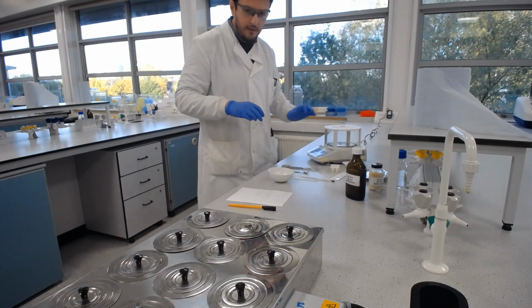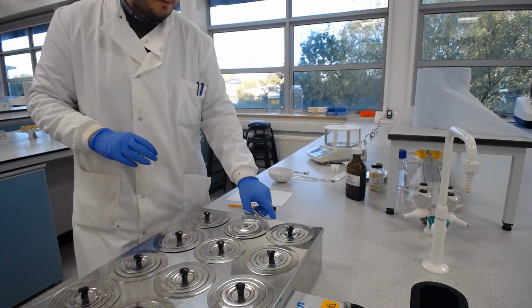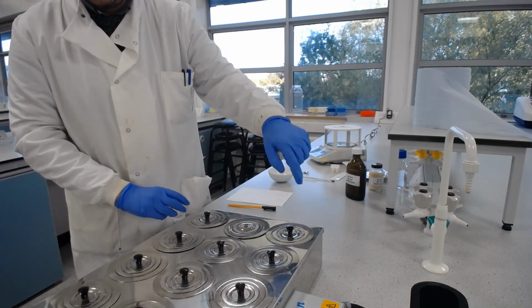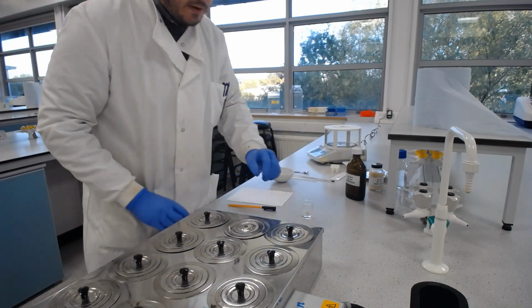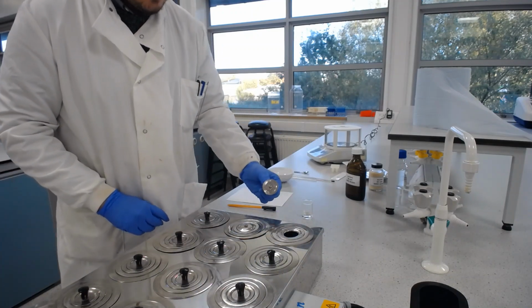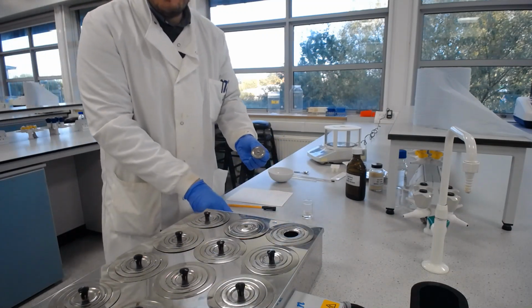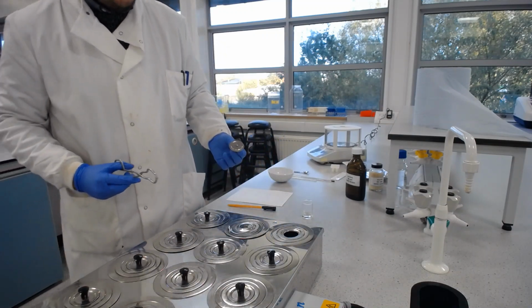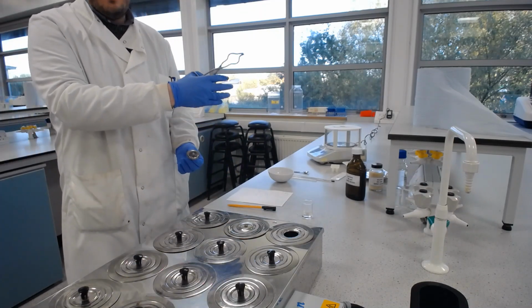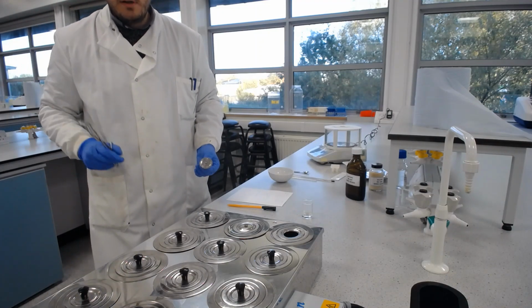So I'm going to take that out, and I'm going to put that onto the water bath to get warming up. Now on these water baths, you can see we've got some concentric rings. The middle one you can take off with a little handle, no problem. But as you may or may not be able to see, there's now steam coming out of there. So 70 degrees is hot enough to burn yourself on, and that's why we're wearing gloves for this one. The ingredients aren't dangerous, but if you get some hot glycerol or hot gelatin on your skin, you know about it. So specs and gloves needed for that.